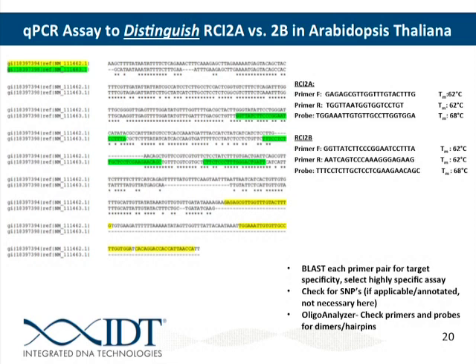0.8. And so then we can click on the hairpin, and OligoAnalyzer will assess the secondary structure for us. You can see down here, these are the predicted secondary structures for this oligo. Tms are well below that 40-degree cutoff that we said earlier is where you start to need to look at it closely and be concerned. You can pull this up and take a look at what secondary structures are predicted, but this should not be any problem for this oligo.